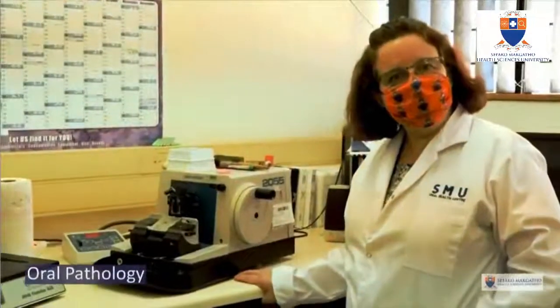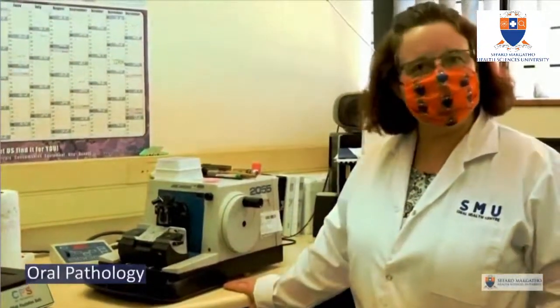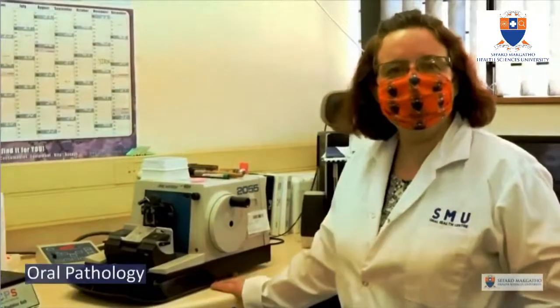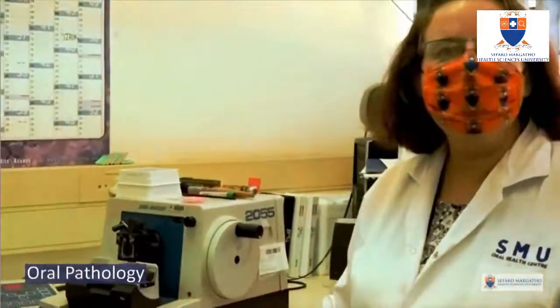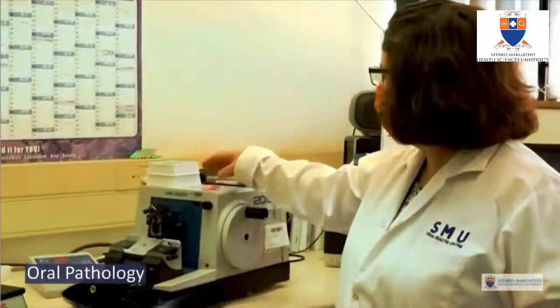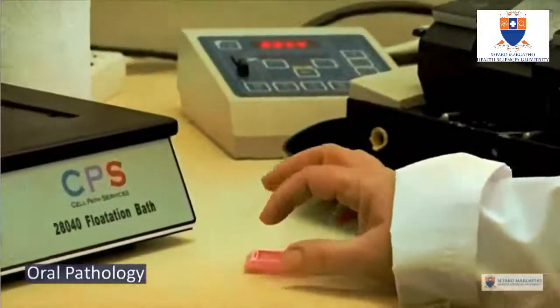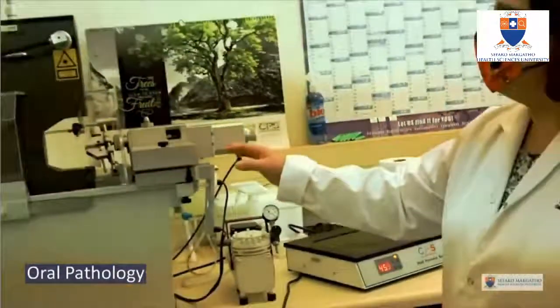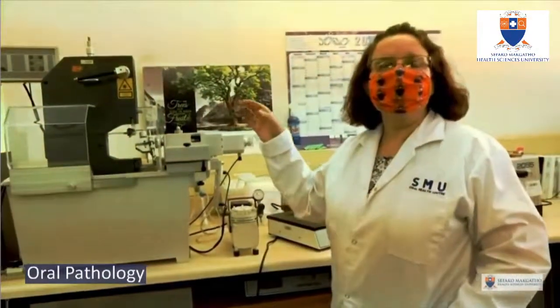You are currently in the Department of Oral Pathology. We are analysing tissue samples that the surgeons send us from theatre, from patients who have any cancerous or non-cancerous lesions. I am part of the technical team, which uses a microtome to make thin sections of tissue samples embedded in paraffin wax. Then we will use the exact band saw. It's got a diamond blade that will cut bony tissue.